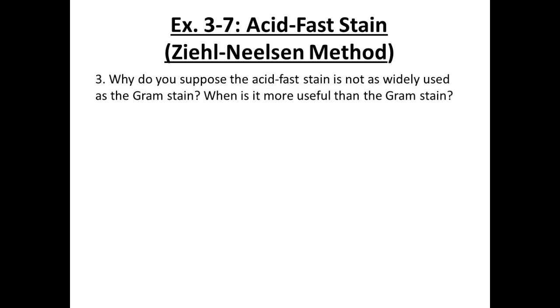Why do you suppose the acid-fast stain is not as widely used as the gram stain? Right, not as many of them are acid-fast. Remember I said it's only one genus of bacteria, mycobacteria. So if you were to start out with that stain and it came out negative, the only thing you've eliminated is mycobacteria.